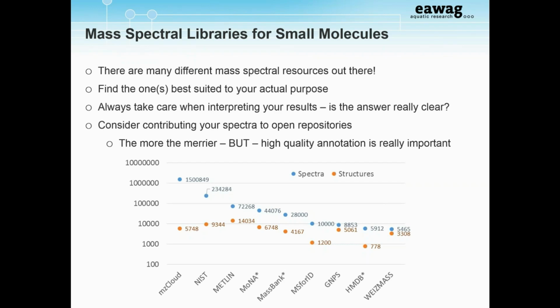Yes. So, in view of the time, two more questions. Is there information in MassBank or the more general libraries about which organisms the compounds were identified in? So, in other words, where to go first? Say you have a plant extract, or say you have an environmental sample, where to go first?